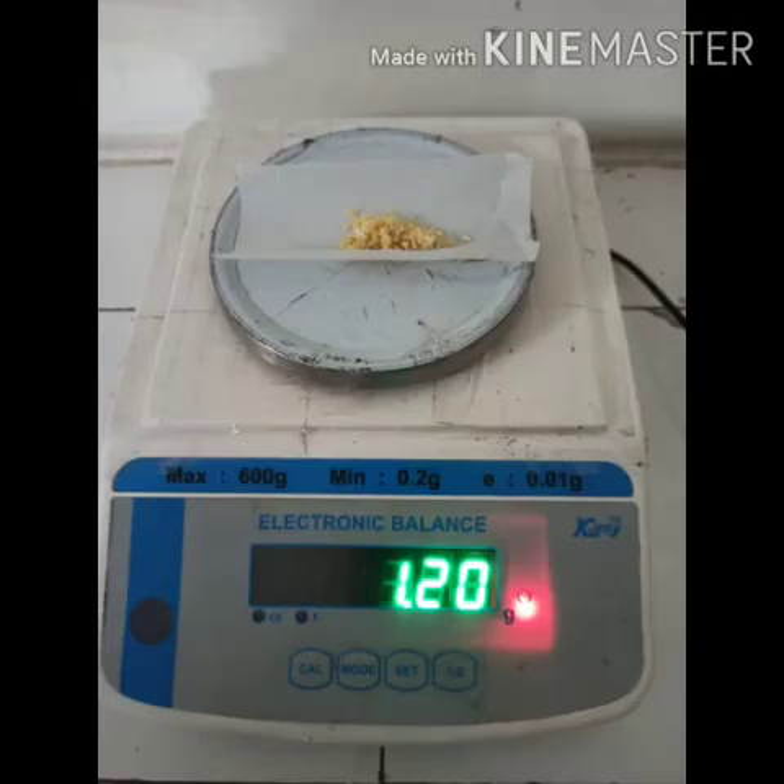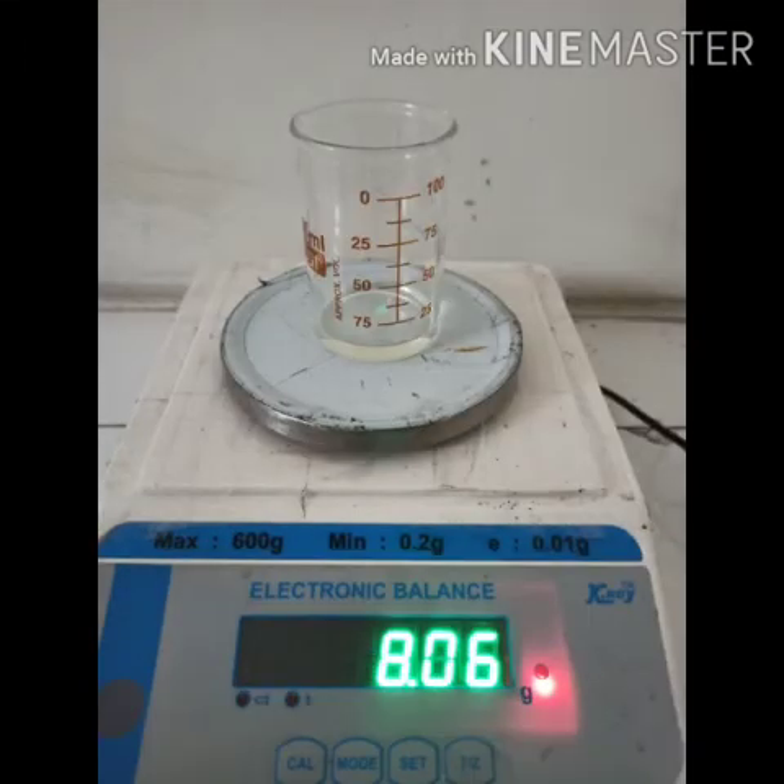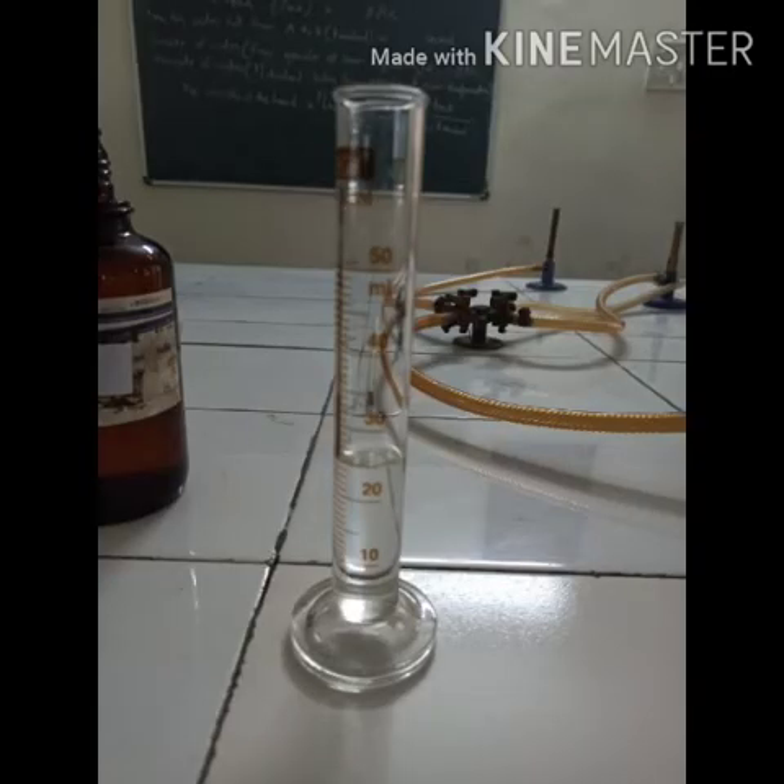1.2 grams of sodium metal was accurately weighed with the help of a digital balance. Thereafter, 8 grams of diethyl melanate was accurately weighed with the help of a digital balance. After that, 25 ml of absolute ethanol was measured with the help of a measuring cylinder.